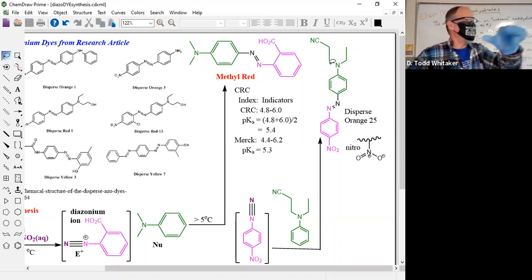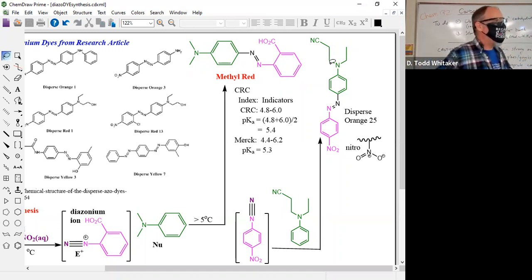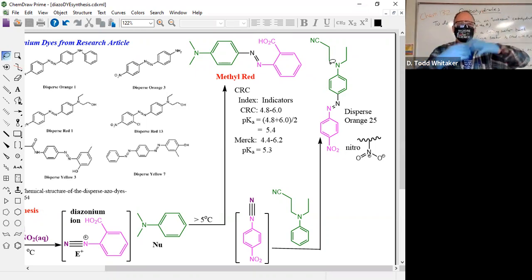He asked, should we use the Merck Index to find the picture of it? I suggest you do that because the Merck Index pictures are right there. With the CRC, it's one extra level. You've got to find the molecule, then go to the data section for the whatever data, then the picture index. And it's not even in the right section, the data for these indicator numbers. So starting with Merck is best.